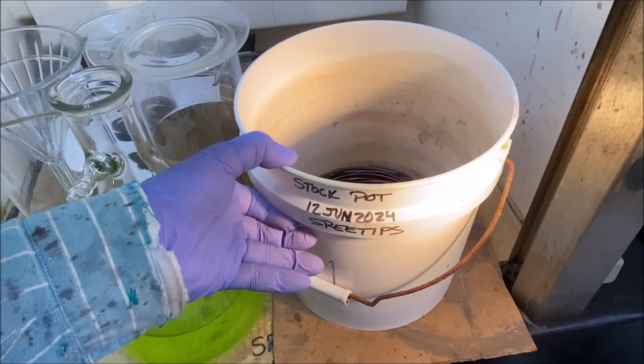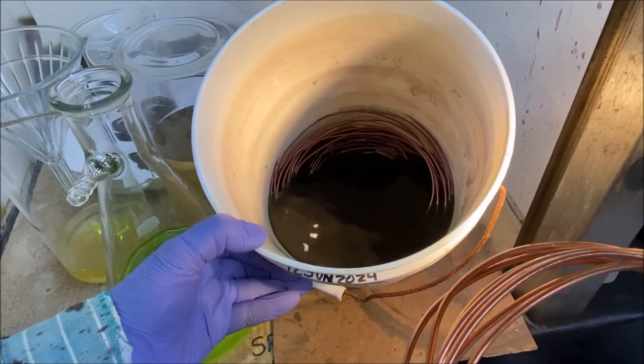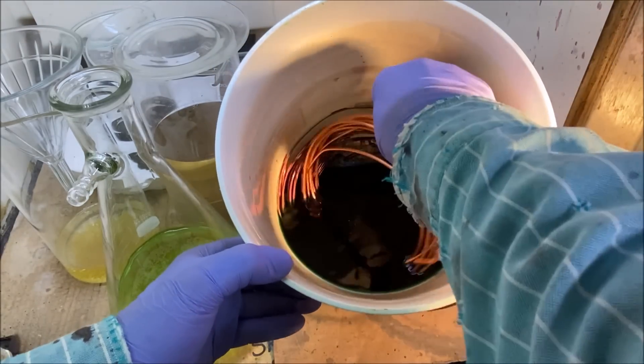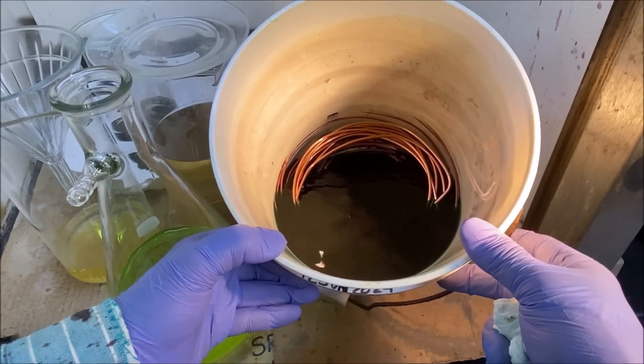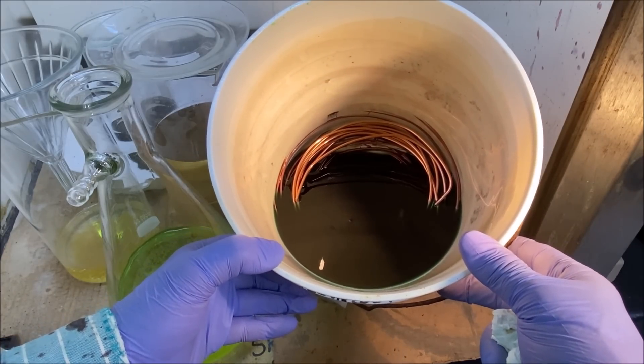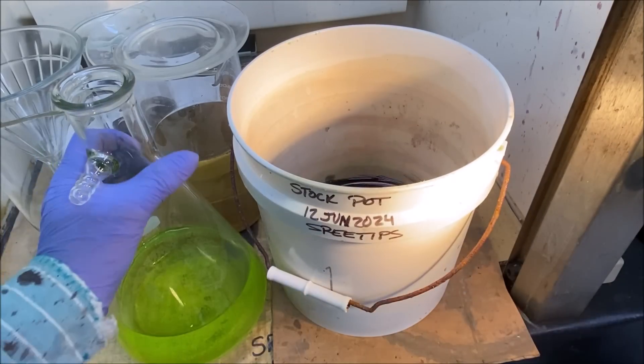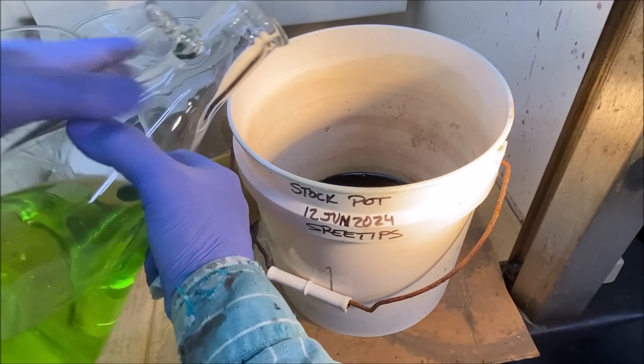This stock pot is full of pieces of copper. And then the platinum group metals will cement out on that copper, fall to the bottom of the bucket as a black mud. And then we can recover them later on.